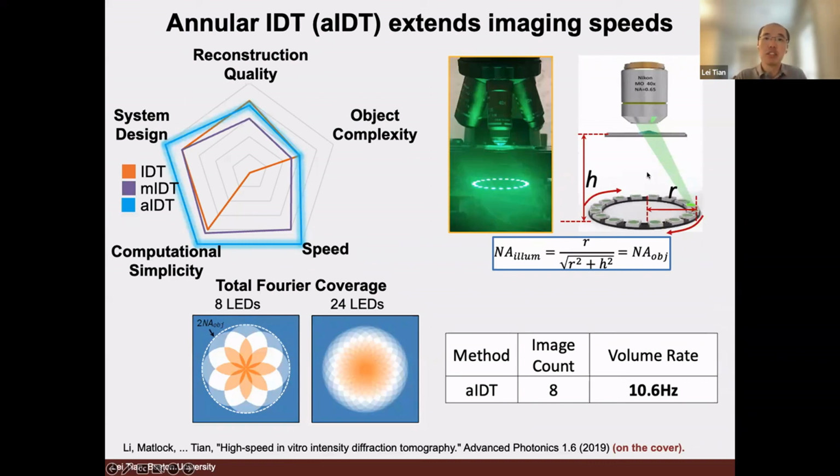For example, for 2D phase imaging, one particular technique known as differential phase contrast has drawn tremendous interest. We did some initial development, and many other groups have done that. That one sometimes requires an array. With this ring, it still works, but the contrast may not be optimized. For that reason, a lot of groups still prefer dense arrays versus a single ring.